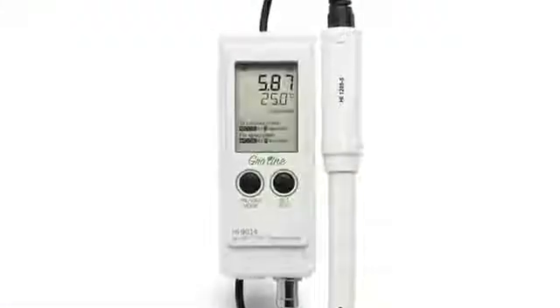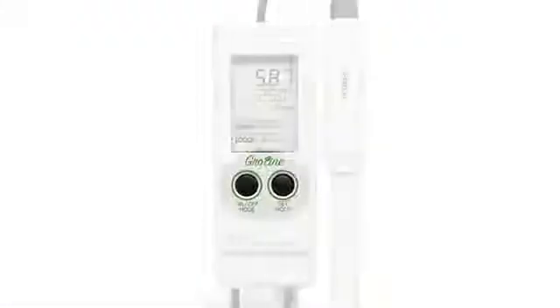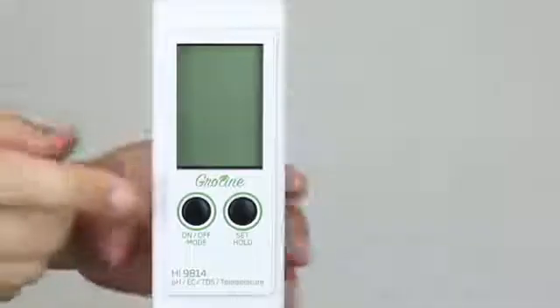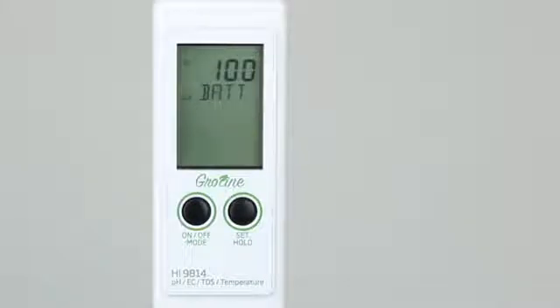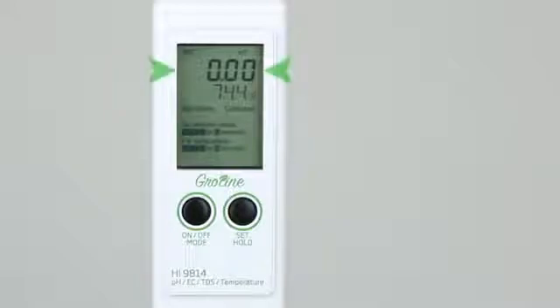All operations are performed through the use of two buttons. Press the on-off mode button to turn the meter on. Note the battery percentage level upon startup. The meter will display the last selected parameter, temperature, stability indicator, and instructions on how to enter calibration and setup modes.